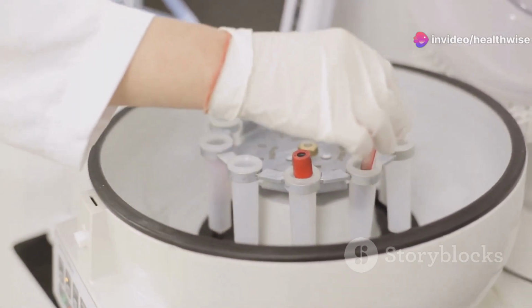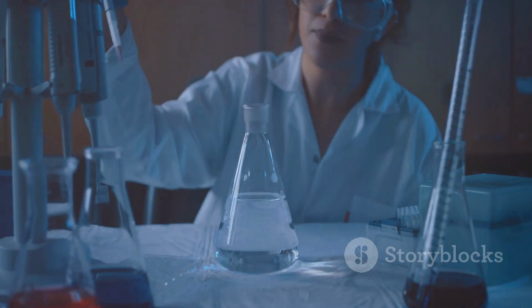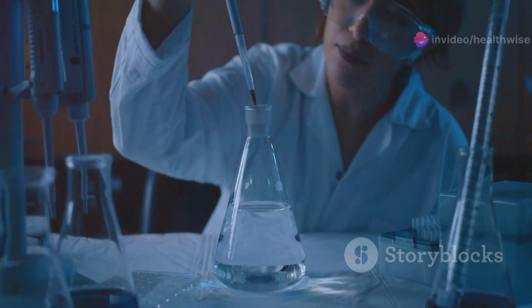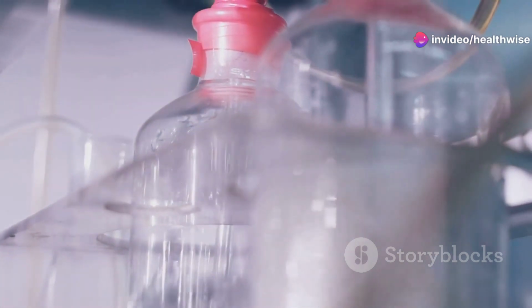Once the solvent front reaches the top, you remove the plate and let it dry. To visualize the separated components, you might use ultraviolet light, iodine vapor, or a chemical spray. For example, ninhydrin turns purple with amino acids. Each component moves at a specific rate, creating a unique pattern of spots.